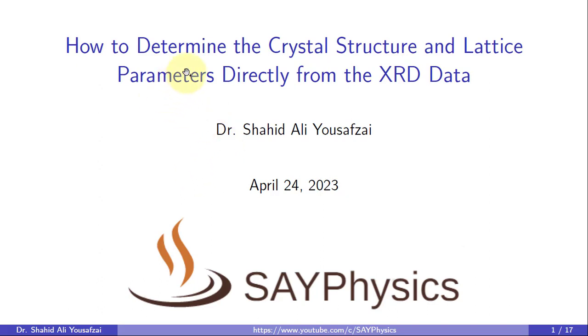Welcome to this tutorial, where we will be discussing a comprehensive method for determining the crystal structure and lattice parameters directly from x-ray diffraction, in short, XRD data.